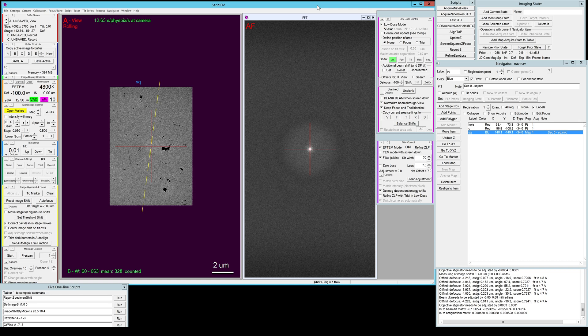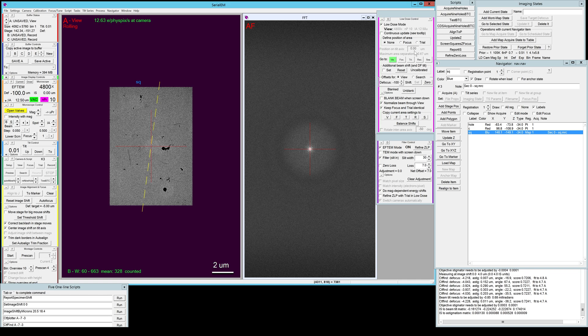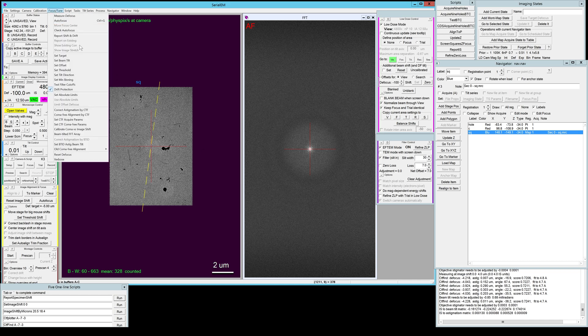I set up low-dose mode with all the necessary magnification and alignments of the different view and record areas. I set the offset for focus and trial to zero, and I already did all the microscope alignments.